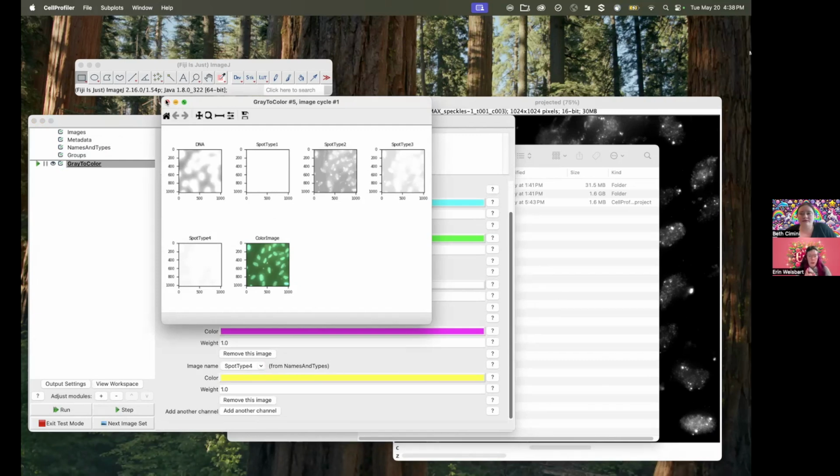I will point out another place one can do that is in the workspace viewer. That is also a really handy way, much like you just showed us in Fiji, of toggling the channels on and off. I think both of us always start in Fiji when we have a new image, because that's really what it's meant for. But CellProfiler does have the workspace viewer, which can be handy especially as you're going through a pipeline, if you already have images loaded in and you're working on them, to toggle that as a workspace and not just in the modules as you go.